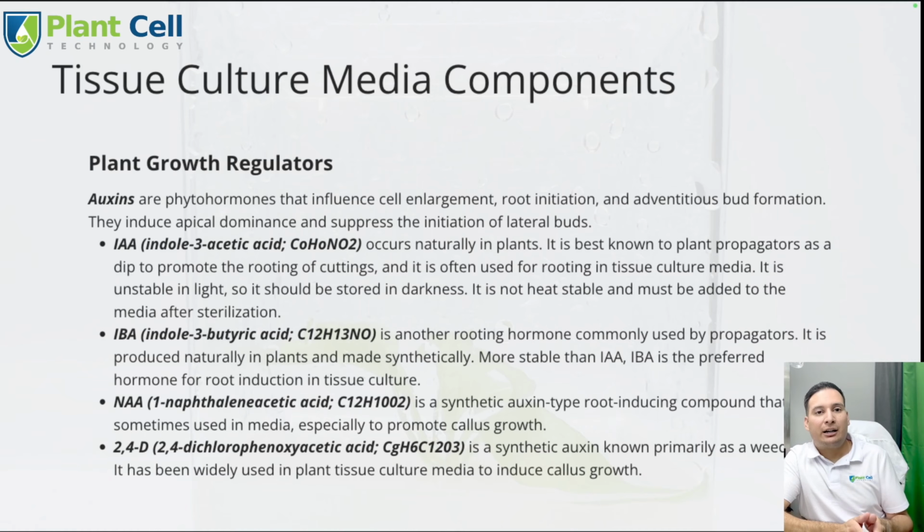I would say on carnivorous plants, like Venus flytraps, they love NAA, and I don't have problems with callus on most carnivorous plants, like Venus flytraps or some Drosera or Pinguicula. They love it, so you can use NAA on carnivorous plants. I use both NAA and IBA. I haven't done a lot of testing to see which one produces more plants or makes the plants grow faster or bigger. That's something I would like to test.